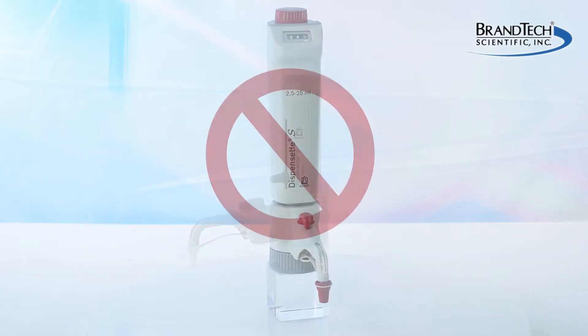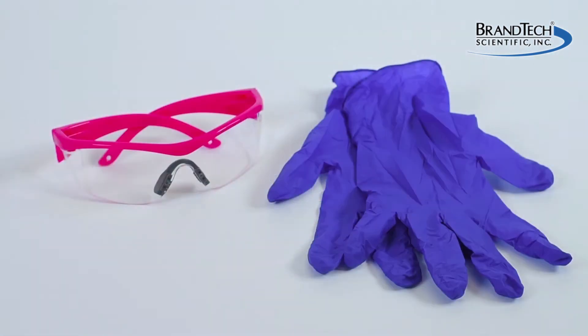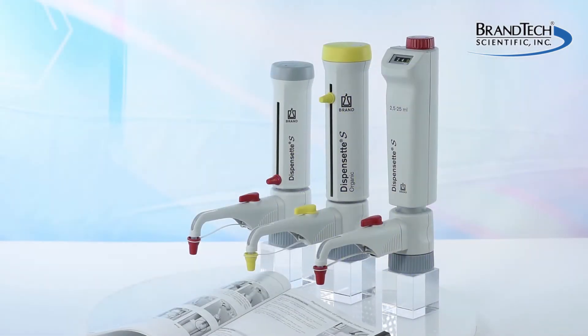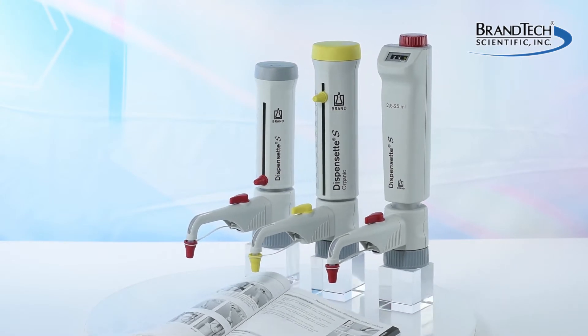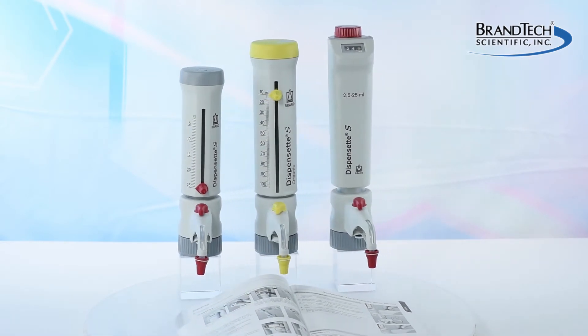This video is not appropriate for the Dispenset S trace analysis. When working with your Dispenser, wear all the appropriate personal protective equipment and observe all safety precautions. Always refer to the operating manual for specific instructions for cleaning and maintaining your particular model.